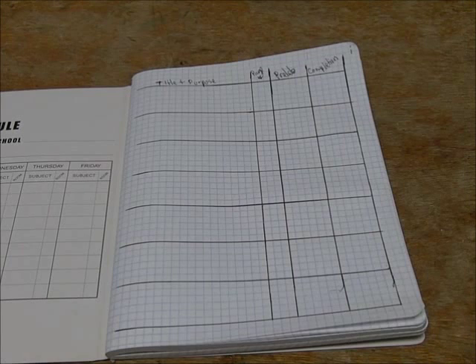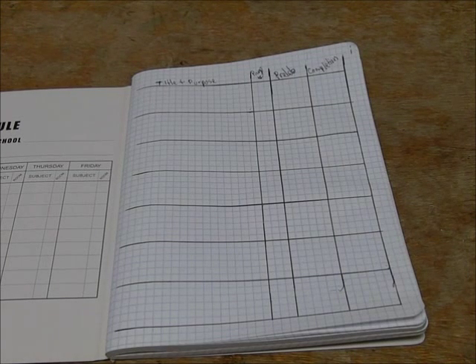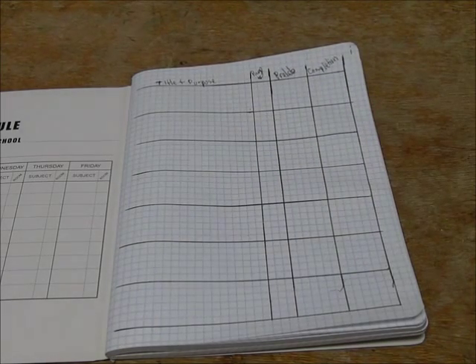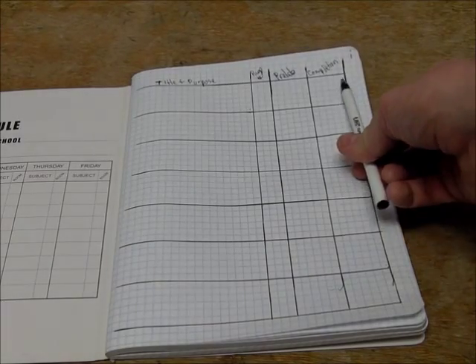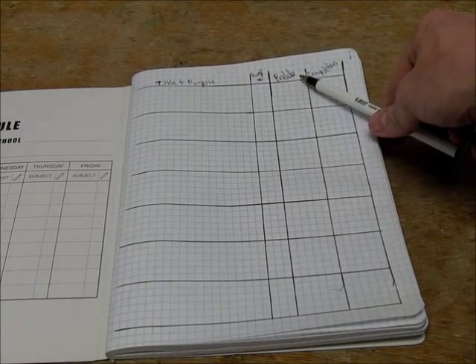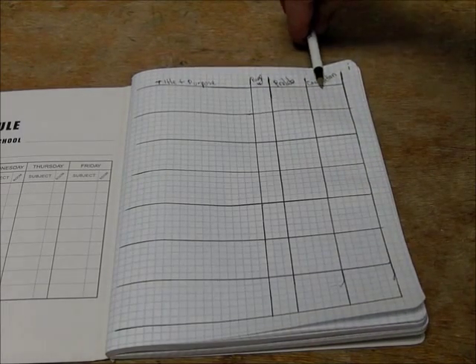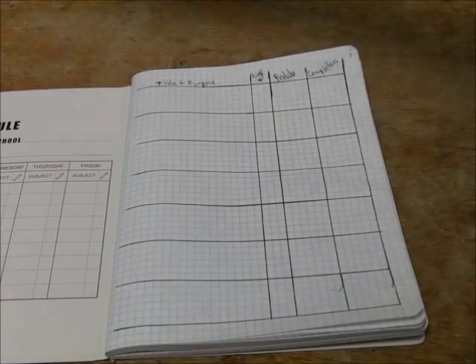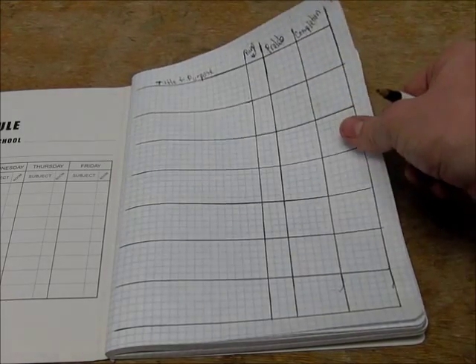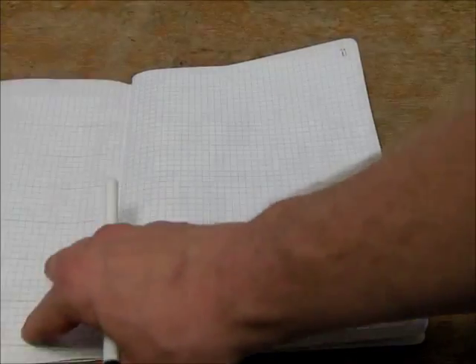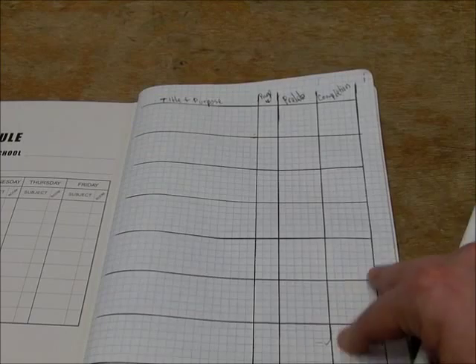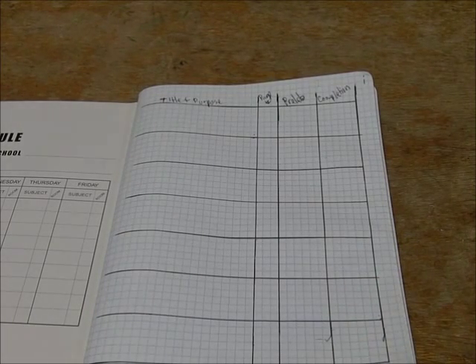So here's the table of contents, the very first page on I that now has been set up. You'll notice that each one of these rows has six squares from top to bottom. Going across here, title and purpose, page number, prelab, and completion. That gave me six squares going across the top for completion, six squares for prelab, three squares for page number, and a bunch for title and purpose. Now with this, I have one page of table of contents done. There are six Roman numerals, pages of Roman numerals, which means there's going to be six pages that look exactly like this page right here. And you get to redo that same type of data table on those six pages.